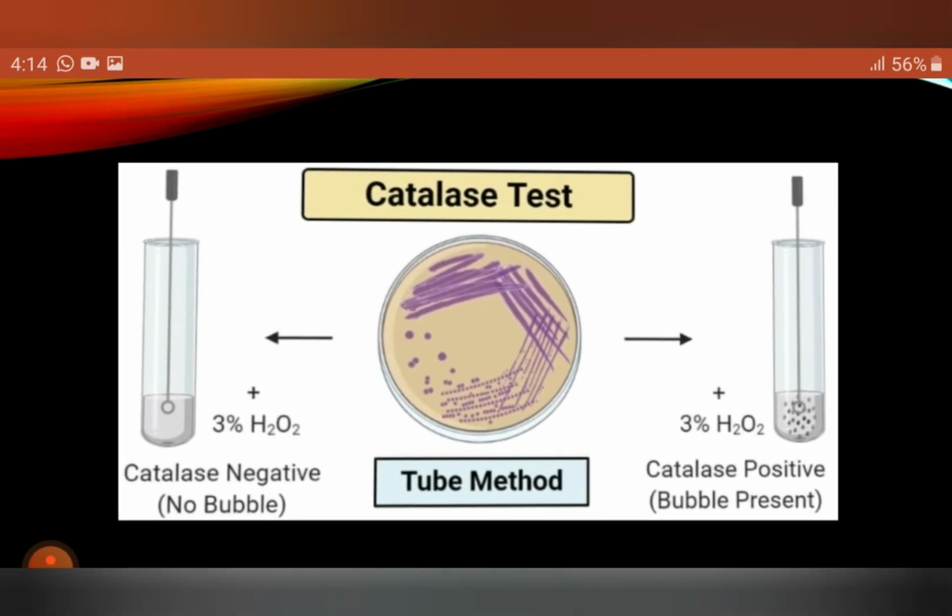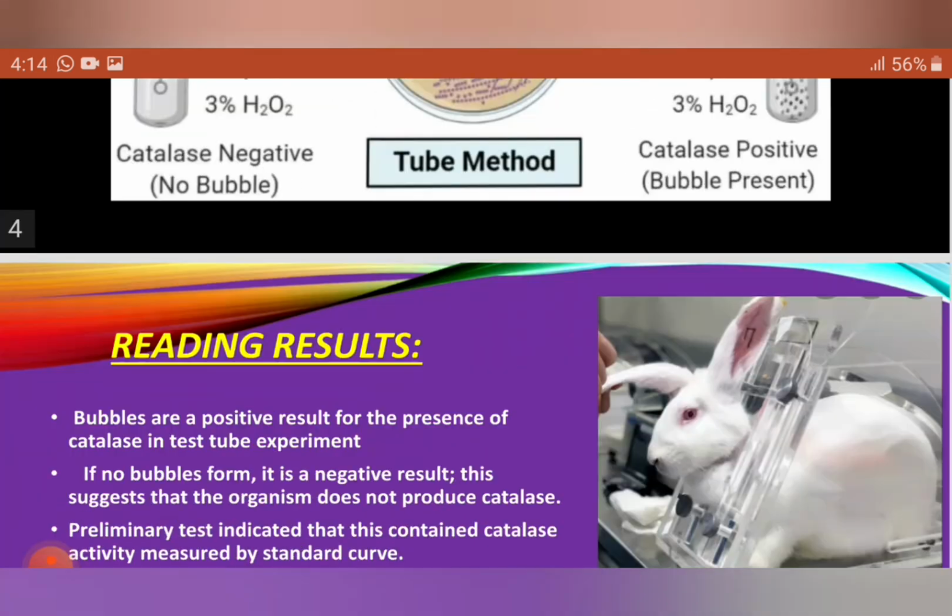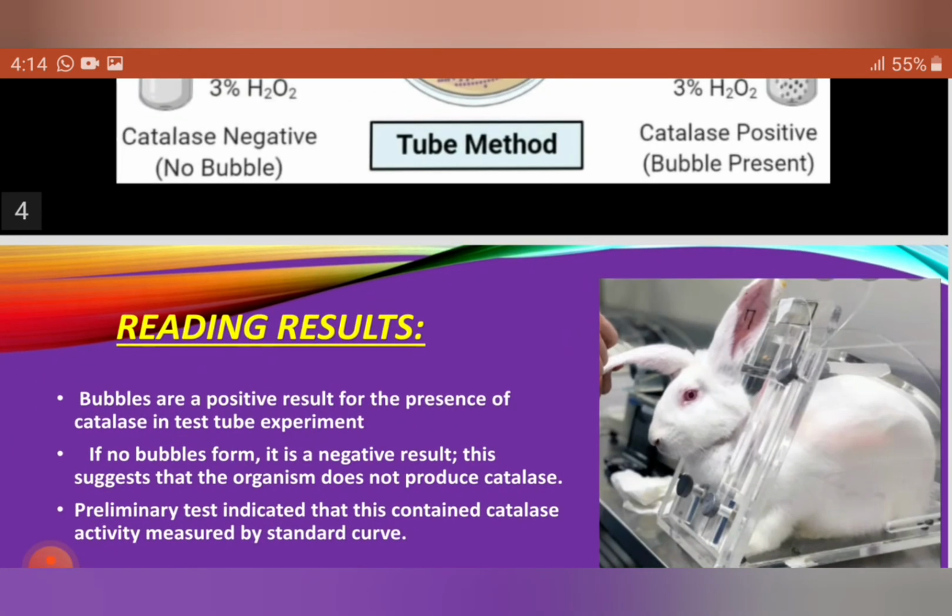So after doing the experiment in rabbit blood sample, if the catalase enzyme is present in the sample of the organism, visible bubbles start to be produced, but if catalase enzyme is not present then bubbles will not be observed, so we observe these results. The reading calculated above has a value of 132.5 micromole.